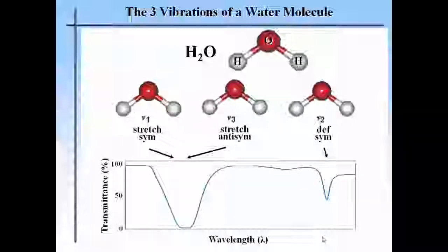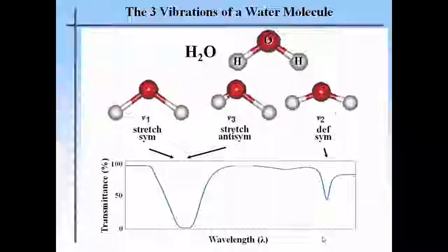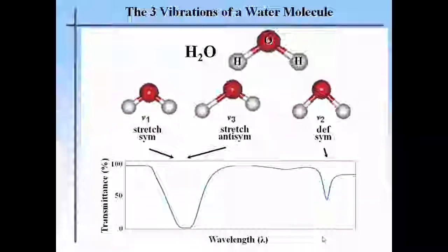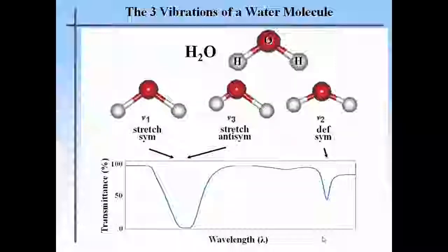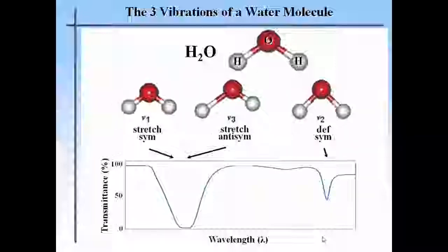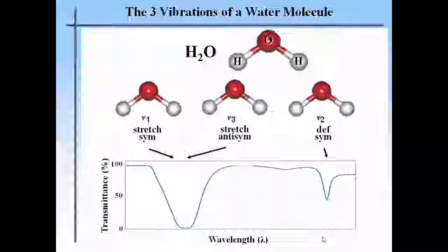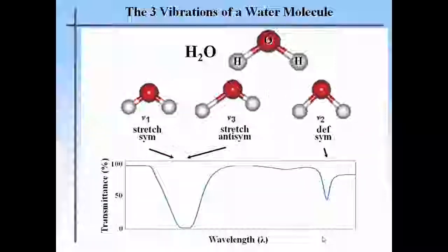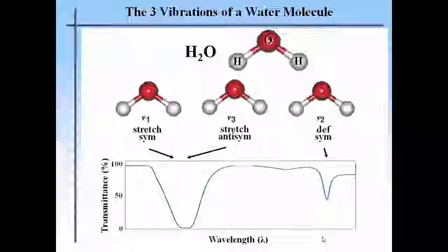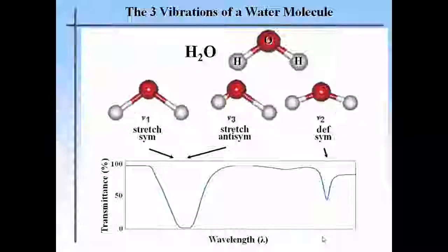Just a word of caution. Think of polymers. Polymers are very long molecules with a huge number of atoms. Now, if a molecule has a molecular weight of 20,000, you may think that it must have a huge number of absorptions according to this 3n-6. It's much easier because these molecules, these polymers, are built up by a repetition of monomeric units. You focus only on the monomeric units. So the vibrations of the long chain are more or less redundant. So you can use it to investigate polymers very nicely, actually.